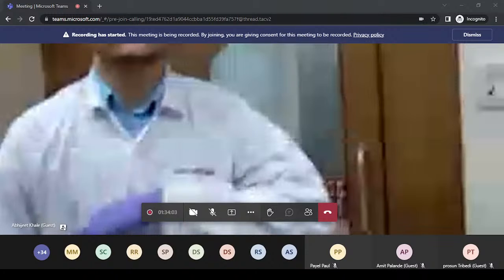So photo documentation and image of the separated band is the key fact in HPTLC analysis. Visual observation plays a vital role in HPTLC analysis. After that, the next step is quantification and identification by using spectra. So we can do quantification as well as spectral analysis in CAMAG Scanner 4. This CAMAG Scanner 4 is acting as a detector in the HPTLC system, fitted again with three different lamps: deuterium, mercury, and tungsten. By using a grating as a monochromator, we can generate any single wavelength from 190 to 900 nanometer as per the lambda max value of our compound of interest.